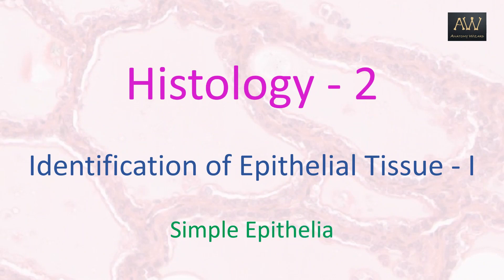In this video, we will look at a methodical approach to identify various types of simple epithelial tissues in H&E stained sections.